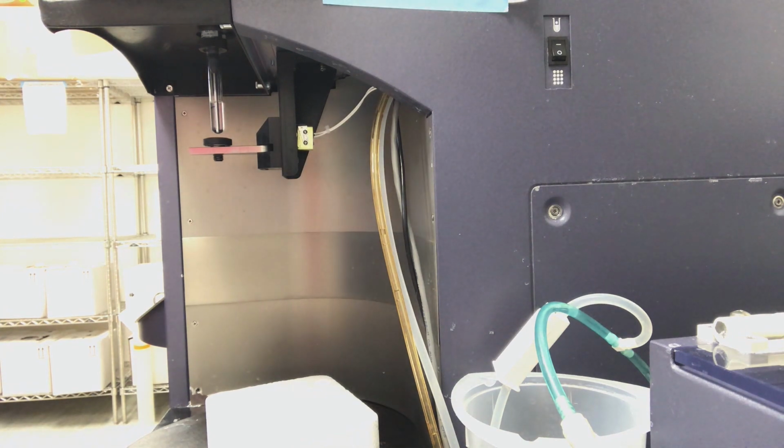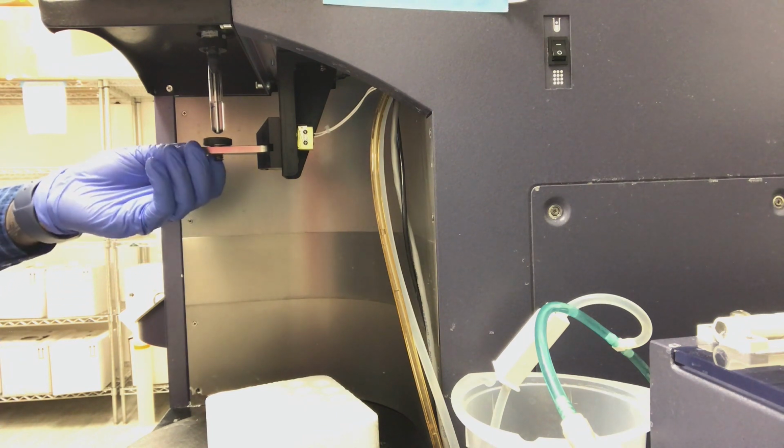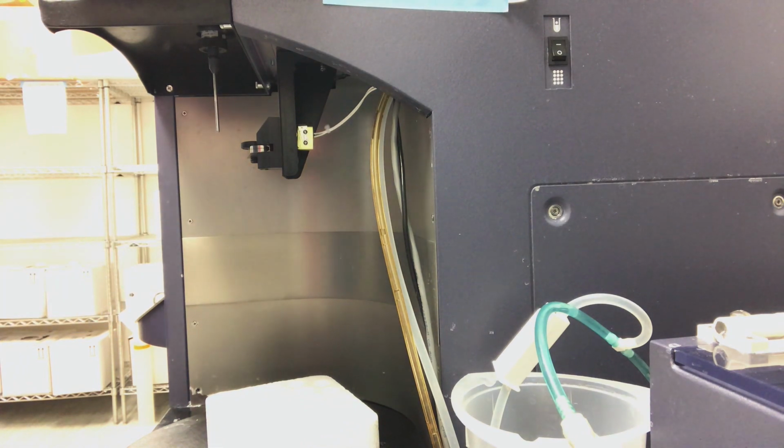At this stage, the machine stays in run until you are done or take a break from running samples. In order to run your next sample, now that the fluidics are stabilized, you move the arm to the side, take the water tube off, take a sample that's been filtered immediately before putting onto the machine. That's key. You always want to filter all of your samples before loading them onto the machine, no matter if it was a step earlier in your sample preparation or not. It needs to be the very last step before loading onto the machine.